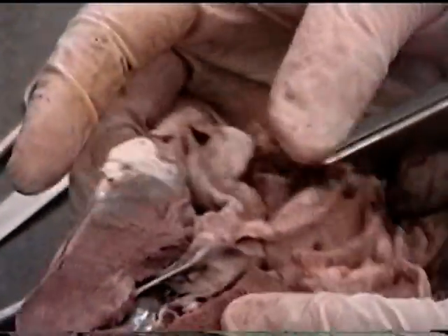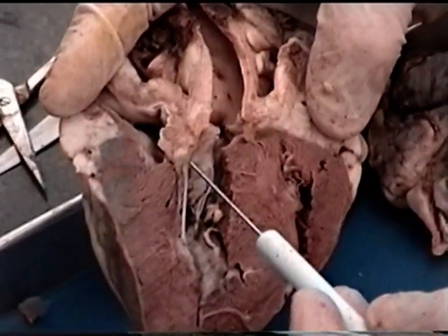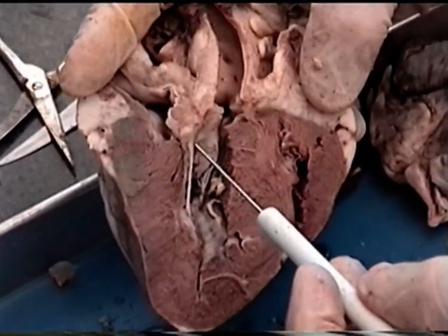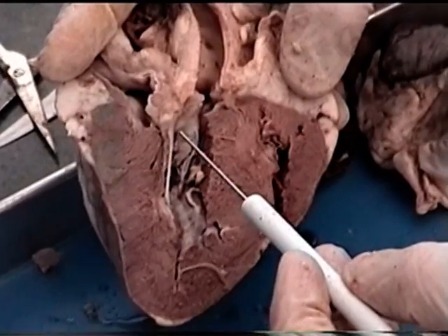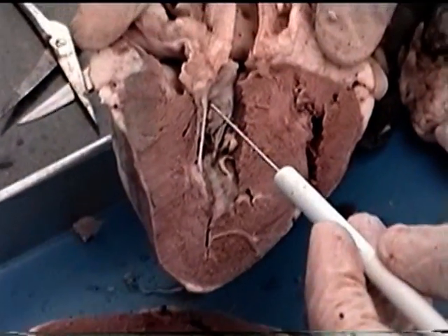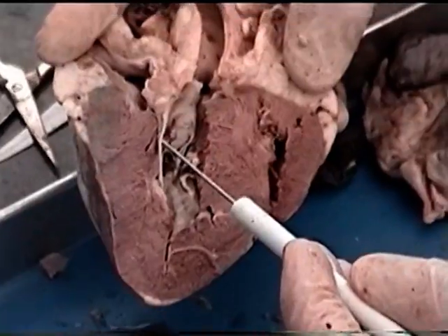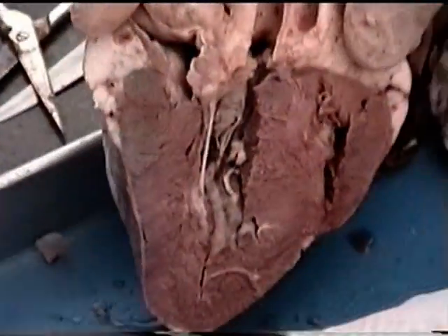And then the heart sounds that we hear clinically, lub dub, are created by the closing of valves and the turbulence on blood that's created by the closing of the valves. And so lub and dub are created by the closing of different sets of valves. So lub, the first one, is the closing of the AV valves, like the bicuspid valve we're seeing here, and the tricuspid valve that we saw over here on this side.